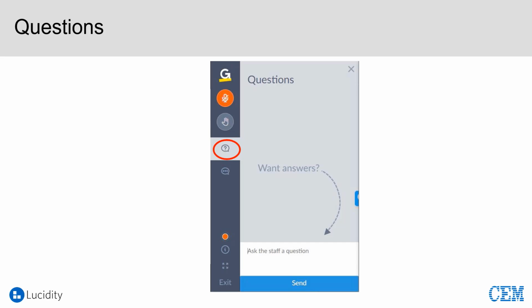Oh, that's Nick here. I assume you can hear me. Yes, unmuted. That's a great question, and I think there's some nice potential to do SPME with miniaturized systems. Again, you might have to take a step back to the way we did it years ago, which is get ready to use yourself as the autosampler at first. Because if you want to do automated SPME, you'll need a rail type autosampler or something like that. But I think there is potential there.